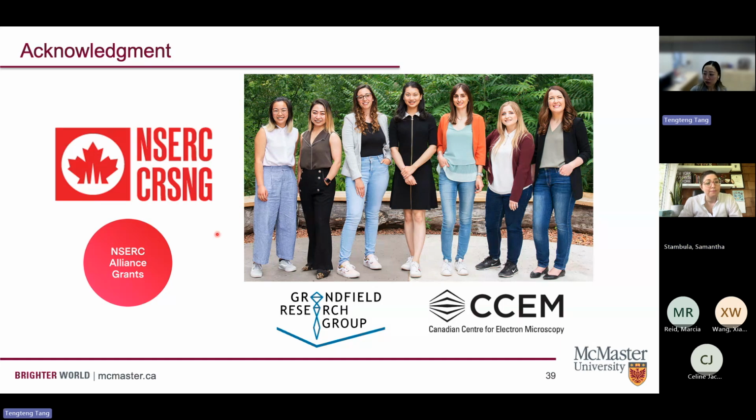Yes, we actually do have a few ideas. I have been talking to Travis, and I have several ideas about not only the PFIB, but we have also talked about how we can correlate the 3D volume imaging, either in the PFIB or just the gallium FIB-SEM, and then do a TEM lift-out within the same volume or an adjacent volume and do TEM tomography, so that we can really bridge all the way.